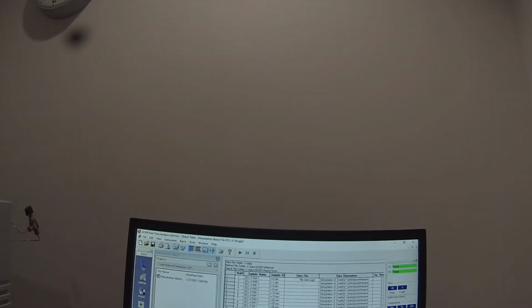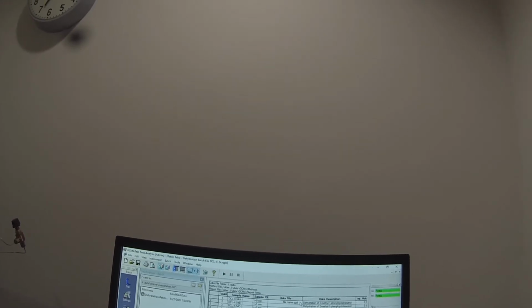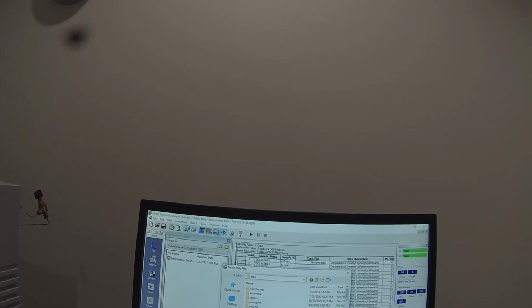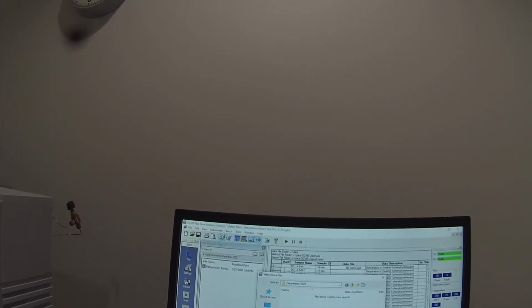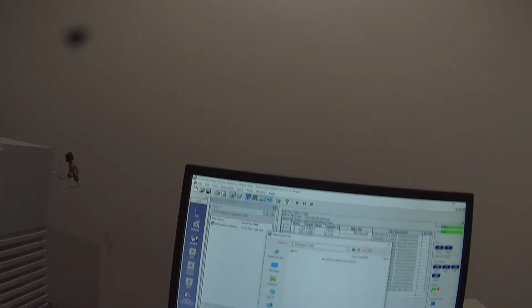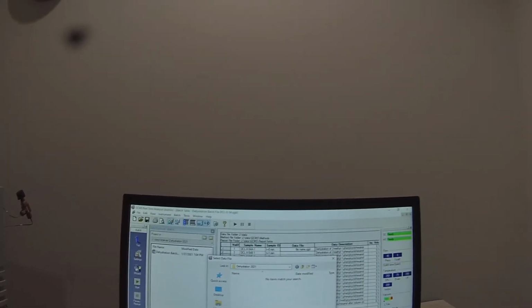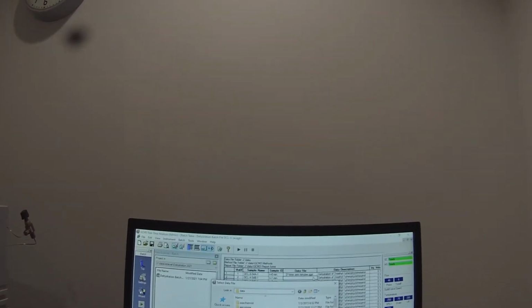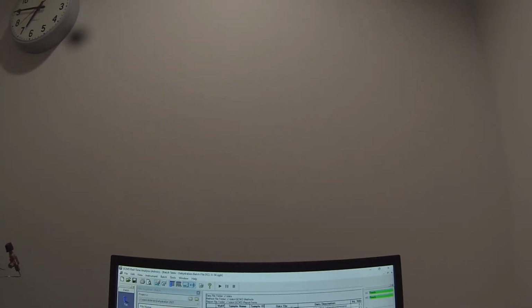So the most important part of the batch file is the data file names. So I need, in this case, to give it a file name, and I'm going to be putting that into the data folder. You see lever dehydration 2021. And I'm going to actually name my files according to their time.